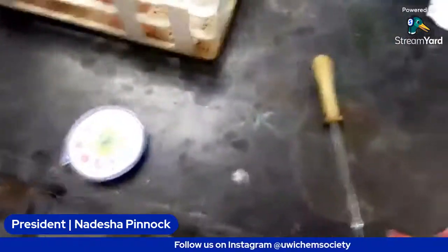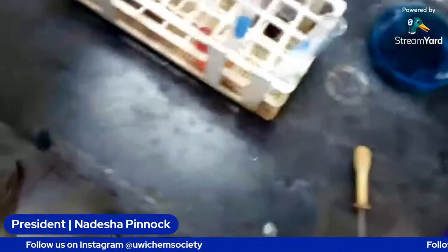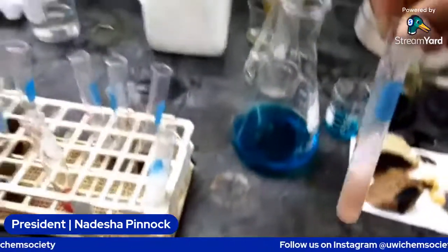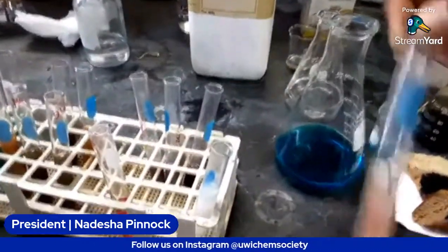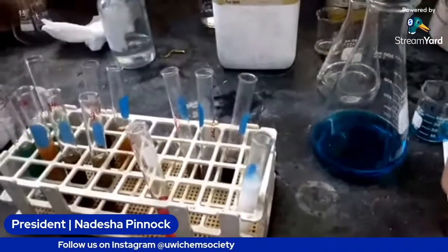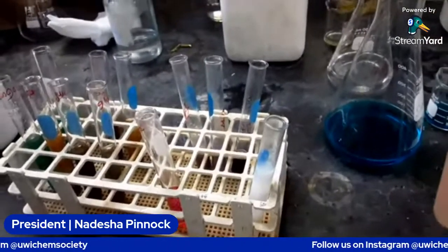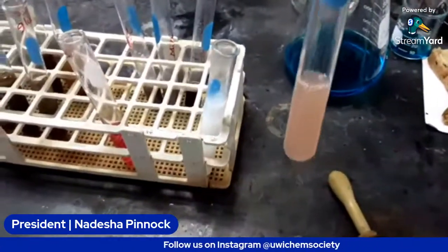It even moves. So we probably have to add a couple of spatulas of carbonate to it. This one's still foaming. So we kind of stop now.